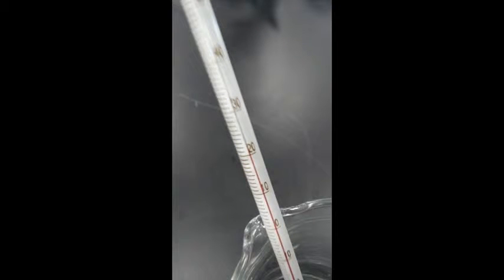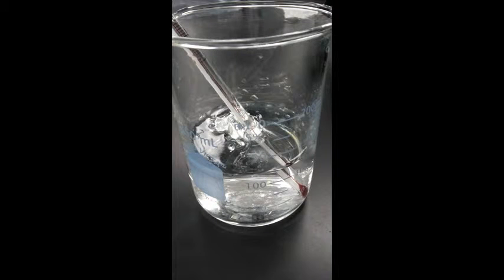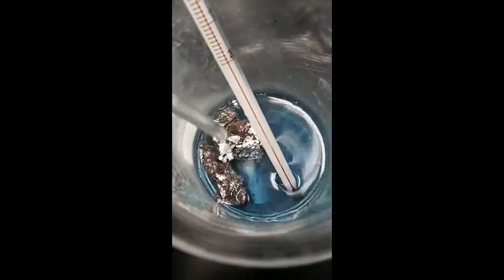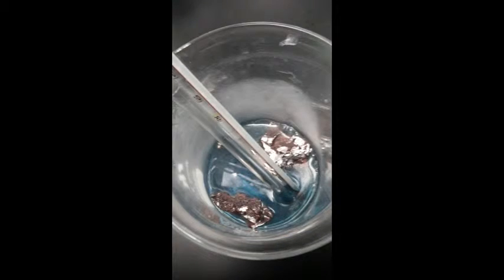In the sodium chloride solution, there was no reaction that took place. The starting temperature of 20.4 was the same after the experiment. The mixture of the sodium chloride solution and the copper(II) sulfate solution experienced a change from 20.9 degrees Celsius to 28.1 degrees Celsius.